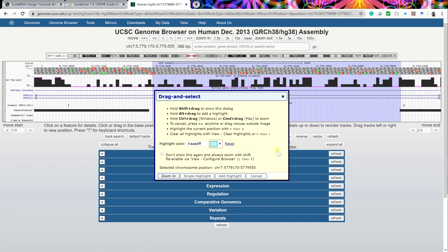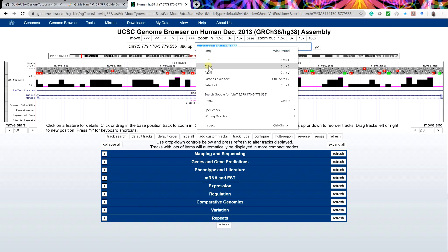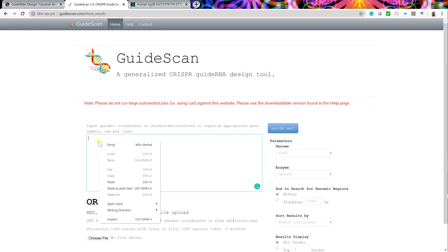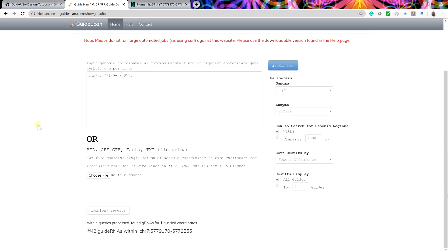After a final zoom to get a clear region, the base position can be copied into the input box by clicking on it and then copy and paste it into Guidescan. In Guidescan, press the guide me button and the guide RNA sequences will be quickly processed. In this instance, 42 guides were found.